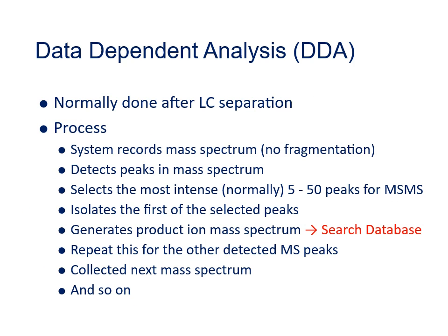There are two ways of using tandem mass spectrometry that are also worth mentioning in this session. These are data-dependent and data-independent tandem mass spectrometry. These are often abbreviated to DDA and DIA. We'll start by looking at data-dependent MS-MS.